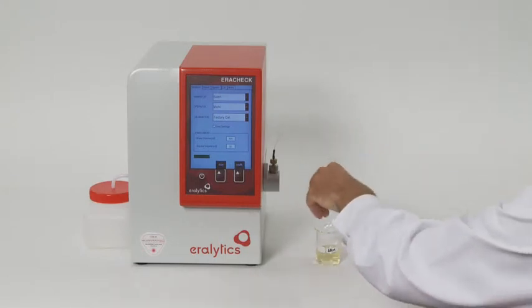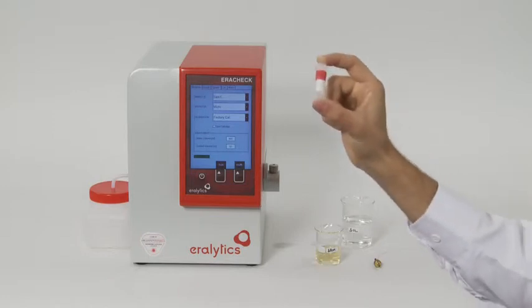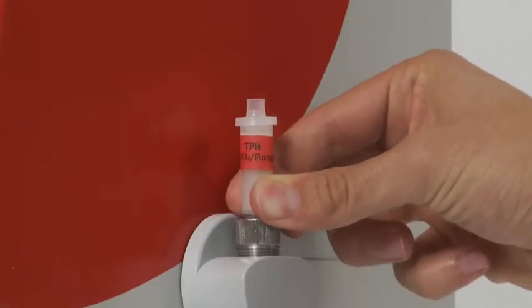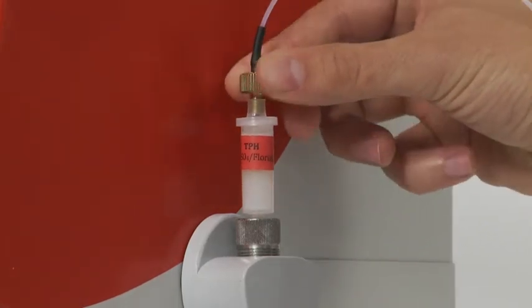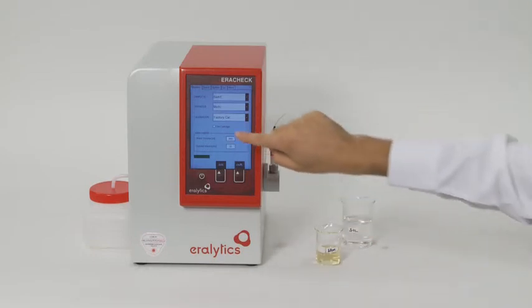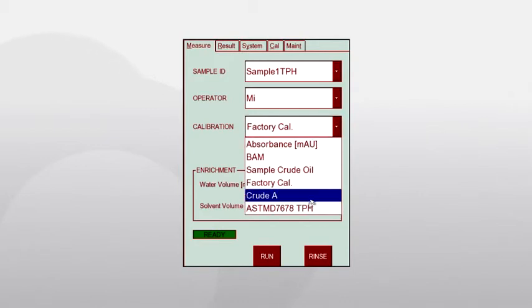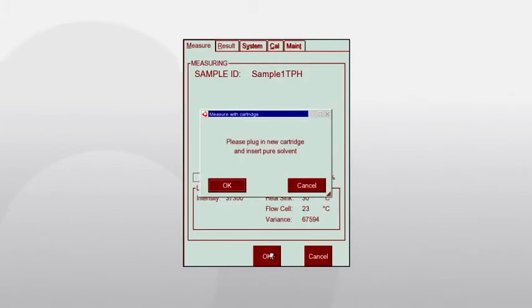If you want to measure total petroleum hydrocarbons in water according to ASTM D7678 instead of oil and grease, both sample and solvent must first be filtered over florisil and sodium sulfate. To simplify this filtration step, a single-use cartridge has been developed that is inserted between the inlet nuts and the inlet tubing. On the display, select 'Use Cartridge' and the predefined calibration for ASTM D7678.